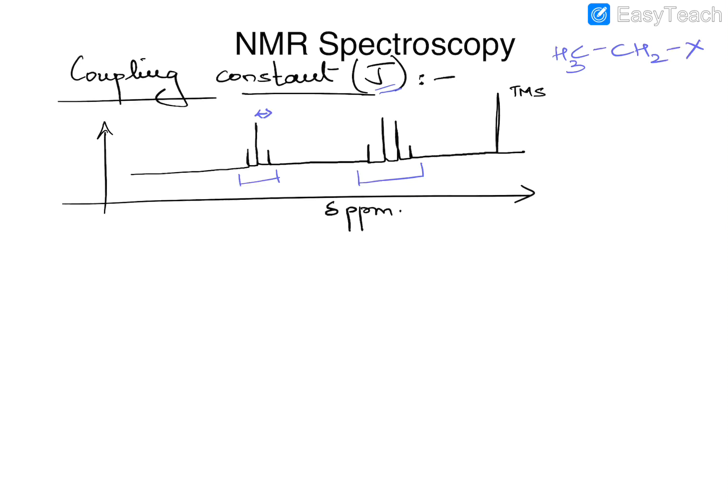difference between the frequencies of individual peaklets also gives us some useful information about the protons which are undergoing coupling, and at the same time it can even help us in doing structure elucidation. For example, if we talk about cis coupling versus trans coupling, based on the extent to which the peaklets are separated from one another, you could predict whether the olefin is cis substituted or trans substituted, and so on.